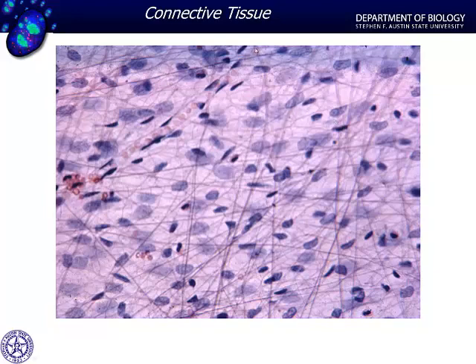Now this is really cool because you can see a capillary. Now I know we're not on blood vessels yet, but this is a capillary. You know it's a capillary because this blood vessel is only about 1 red blood cell in diameter, and it only consists of 1 cell layer, these very thin, flat epithelial cells. And since we just left epithelium, how would you classify that epithelium? Simple squamous.